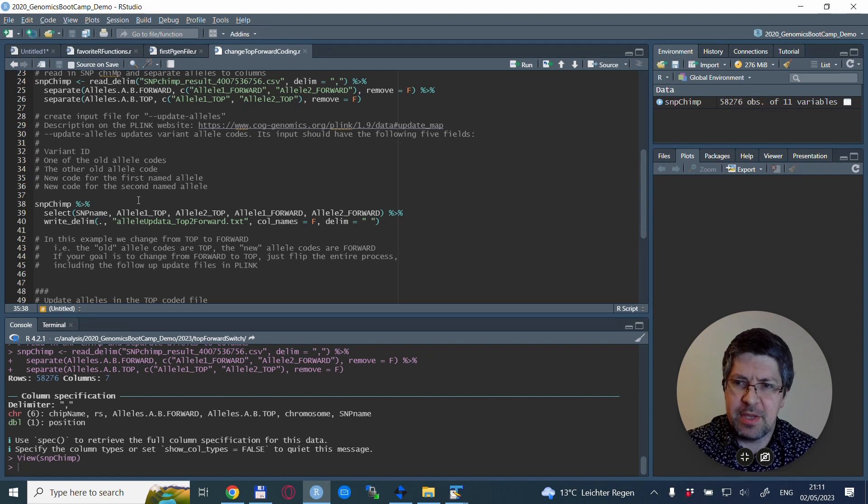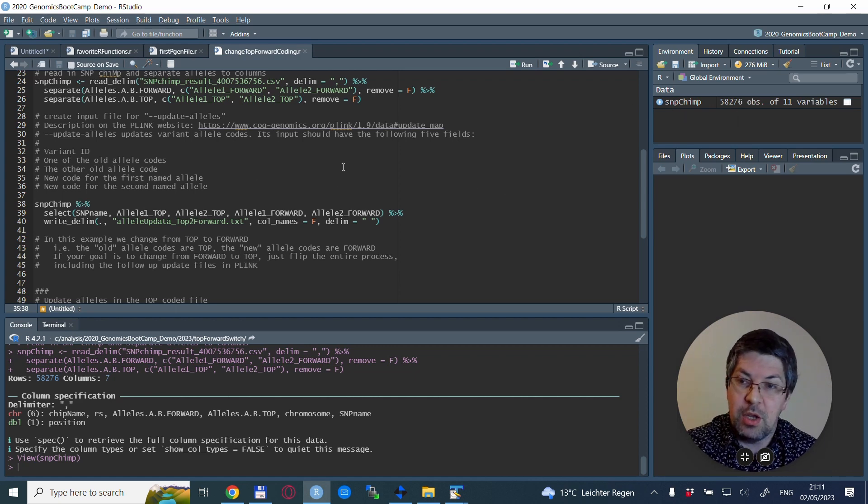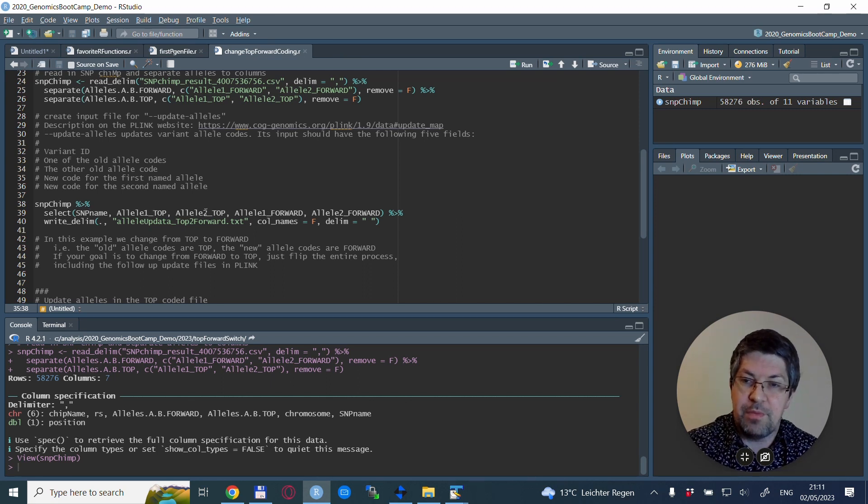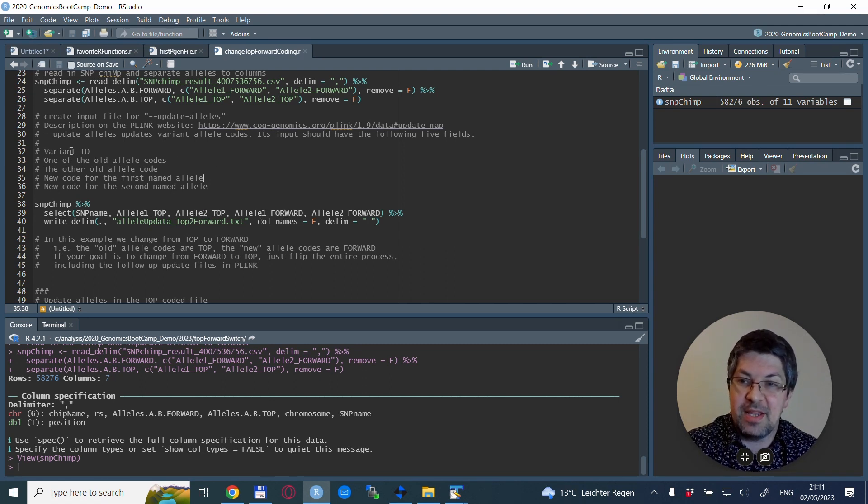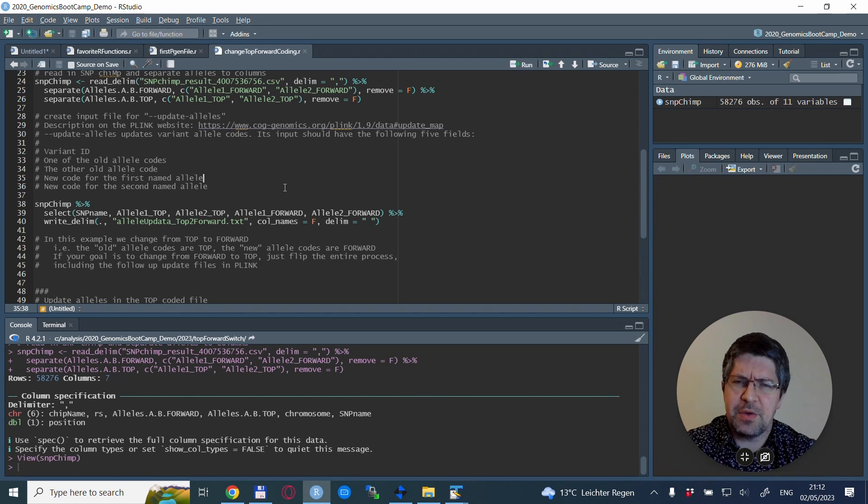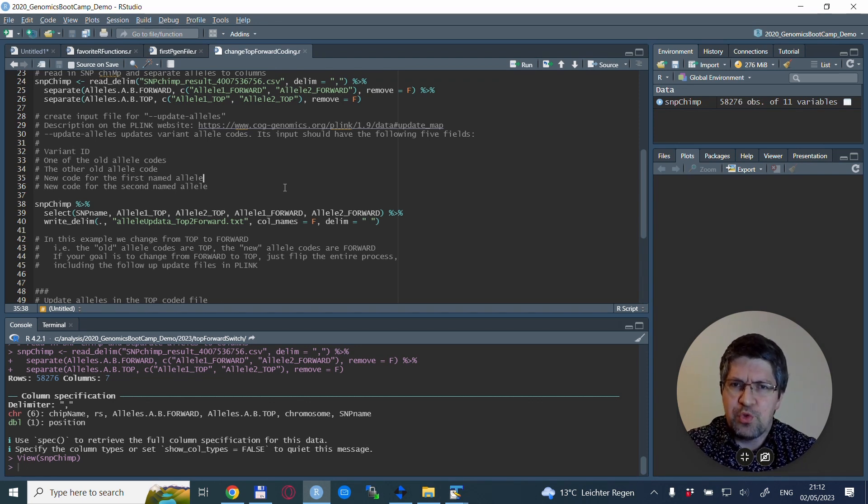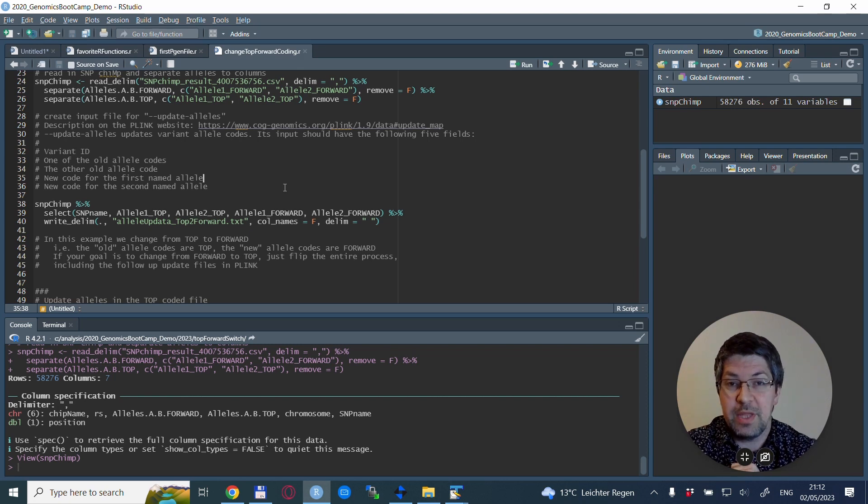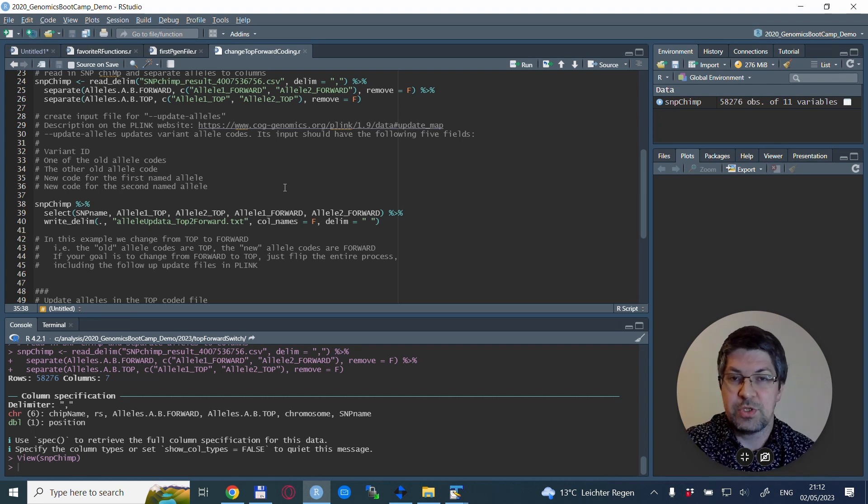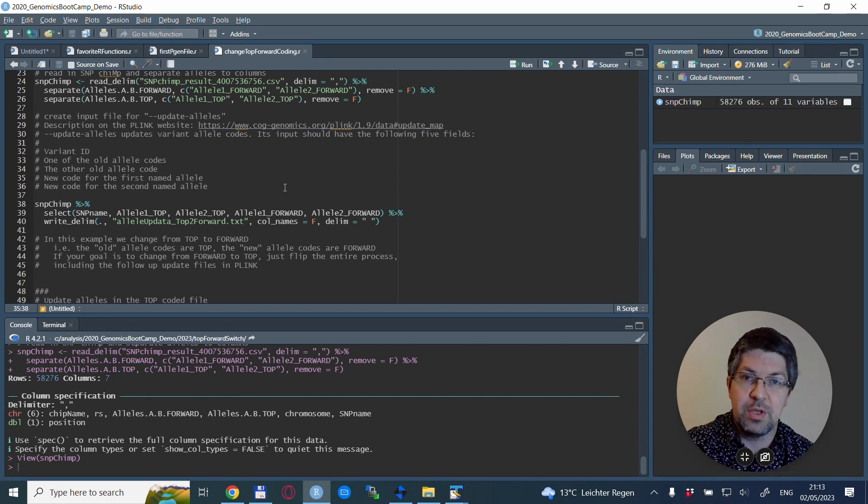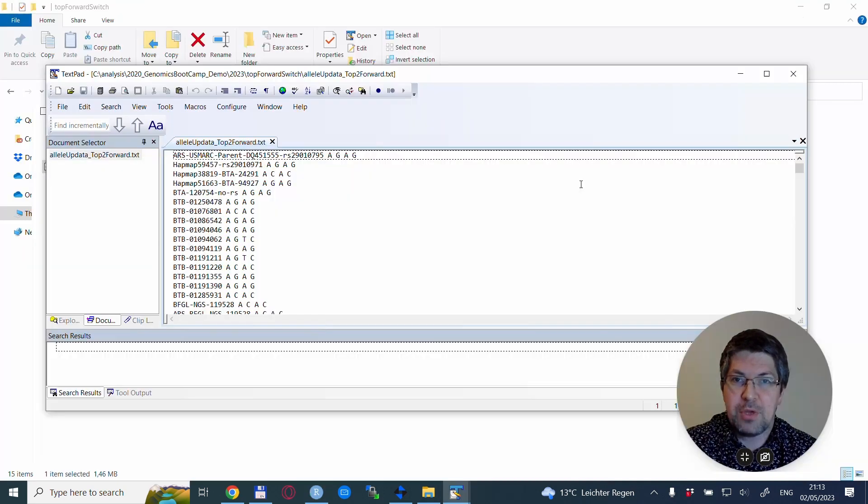This is exactly what we're going to do. It's really easy in R. We start with this SnipChimp dataset and we select the columns we want: SNP name, allele TOP one, allele TOP two, allele one forward, and allele two forward, exactly according to these recommendations. In this example we are changing from TOP to forward allele coding, so our old allele codes are the TOP coding and the new allele codes are the forward coding.